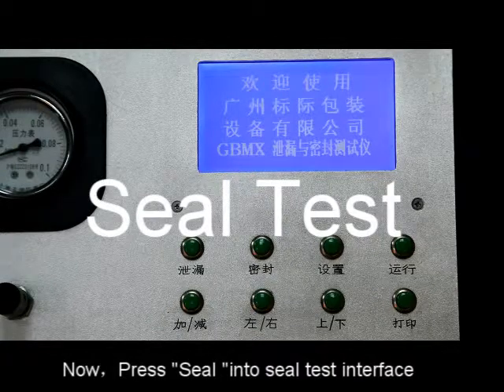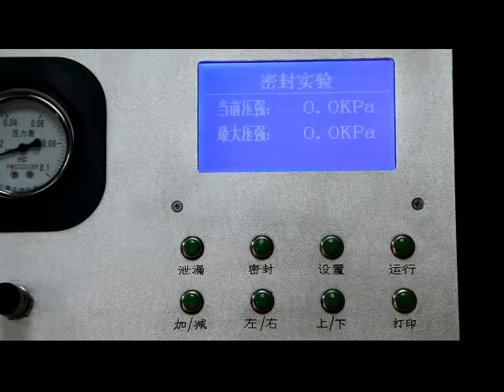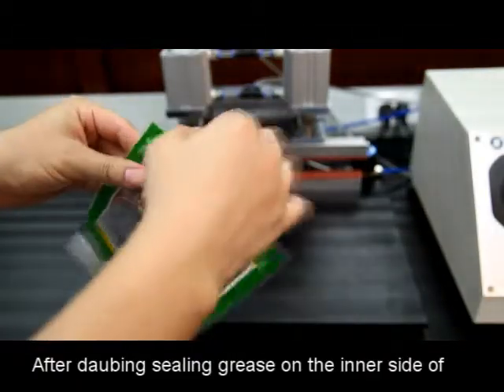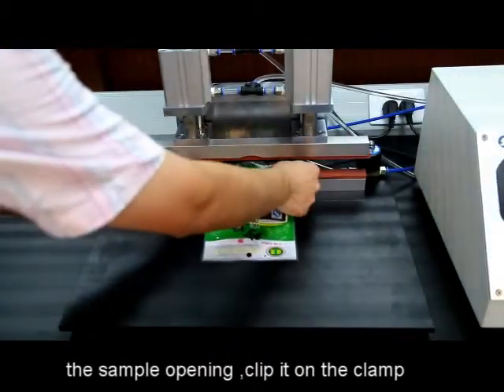Press seal into the seal test interface. After applying sealing grease on the inner side of the sample opening, clip it on the clamp.